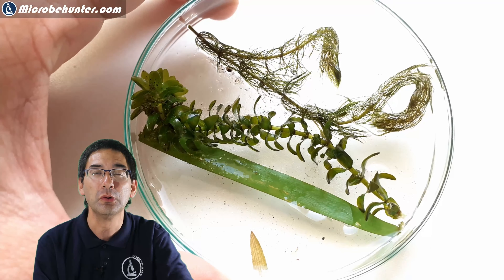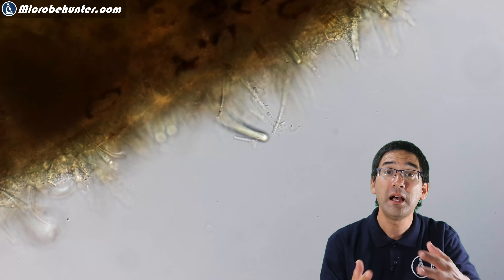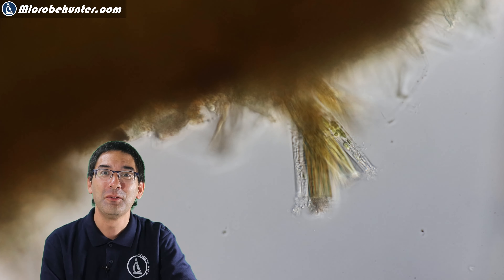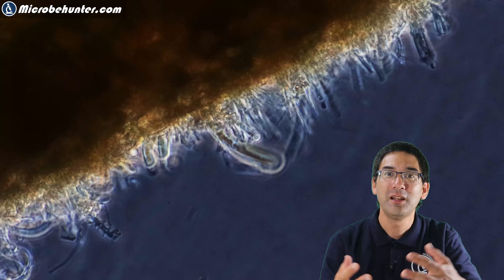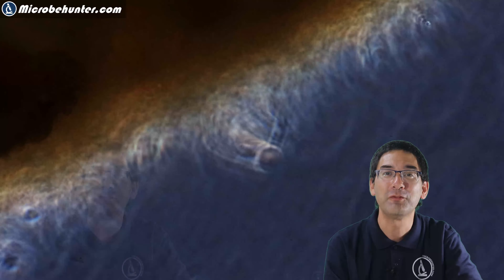A biofilm is a complex association of different microorganisms growing on a surface. These biofilms can contain many different species — we can see different shapes and forms, and I can imagine there may be even more bacteria in a biofilm than the plant even has plant cells. This small microscopic colony here is diatoms; they also like to attach themselves wherever they can find a good place. Here in phase contrast, the biofilm appears even brighter against a slightly darker background, which really shows how much diversity there is.